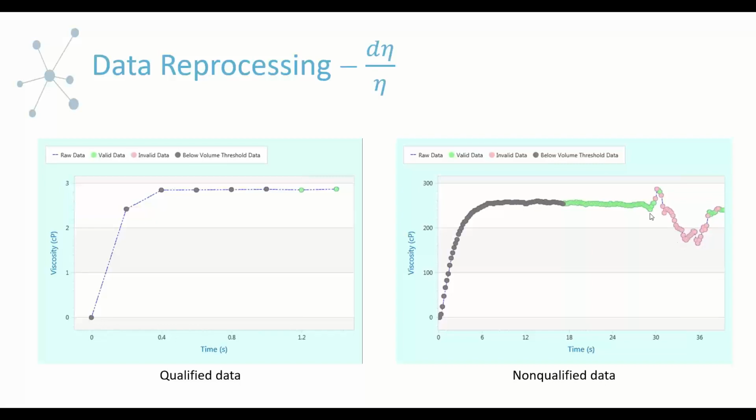And with bubbles like this, they can influence the curve here. You can kind of see it's on a declining trend. It's getting smaller as it gets closer to the bubble, and then it looks really crunchy, as I like to say. And so I wouldn't even try changing the yield on this one. I would just say, okay, this is non-qualified data.